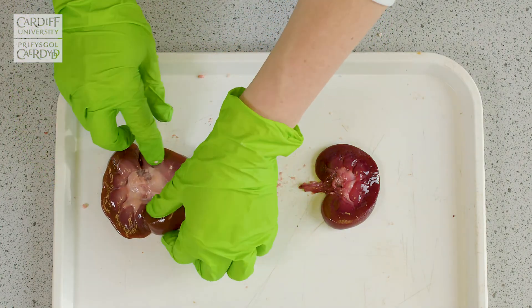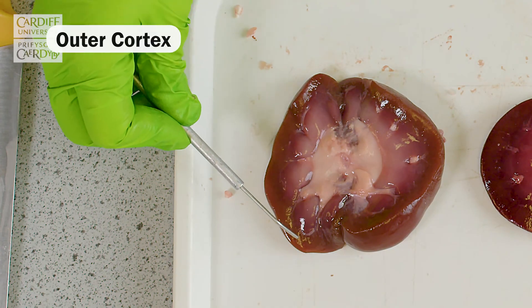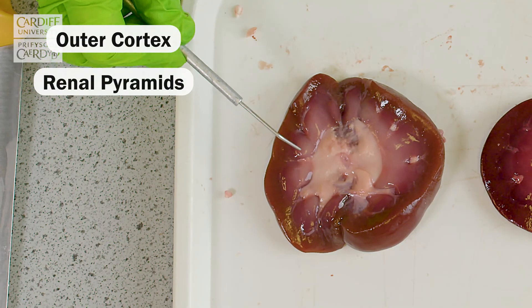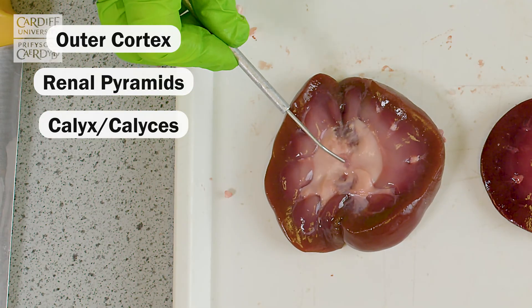This is what we call anatomical variation. So showing those same structures on this other kidney that we've dissected previously, you can see the outer cortex, the renal pyramids and the white tissue here, which are the calyces leading to the hilum.